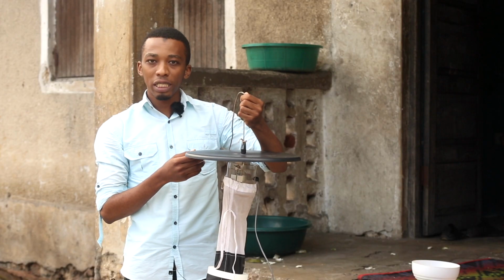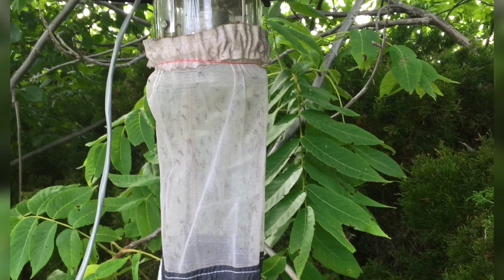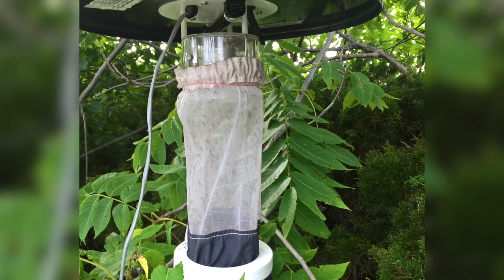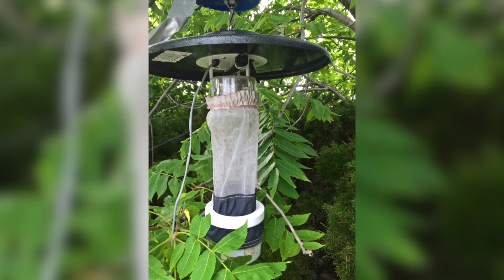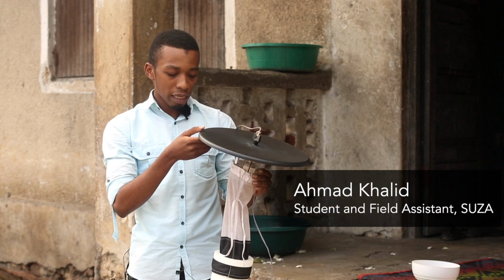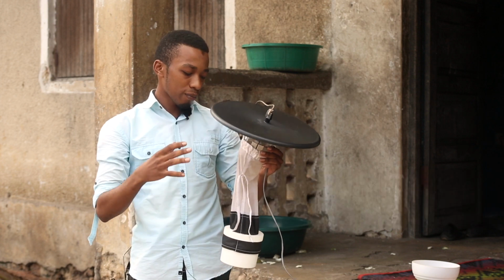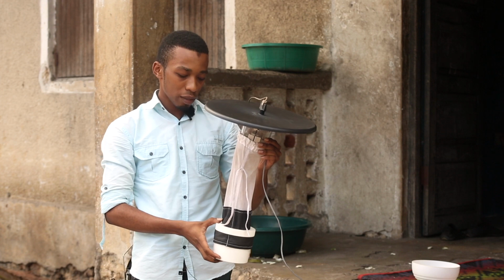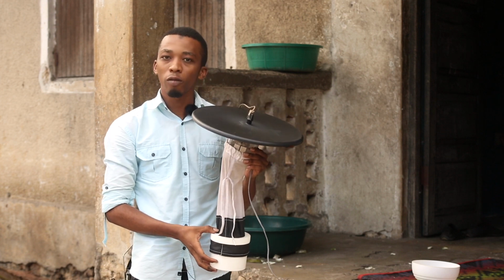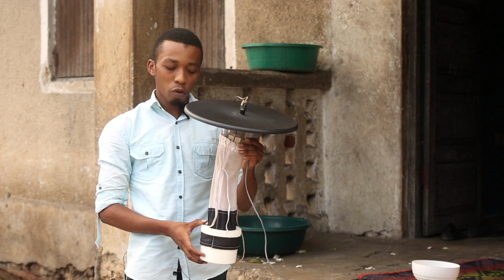So this is what's known as a light trap, and we use a light trap to trap night-biting mosquitoes, including Anopheles and also Culex. The light trap is set in a room where people sleep, a room inhabited by people, and we use it to attract mosquitoes. We set it for about 12 hours during the evening, and we collect it during the morning.